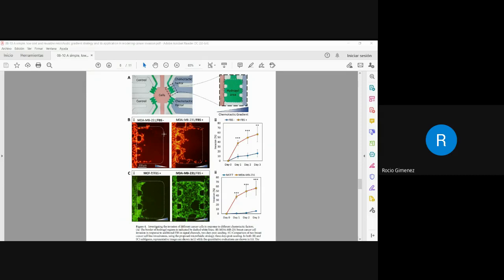The results show that the microfluidic strategy supports cellular attachment, proliferation, migration and invasion without the requirement of any coating procedure. As expected, the invasion of the cancer cells into the extracellular matrix was enhanced by the application of higher fetal bovine serum concentrations in the signal channels.